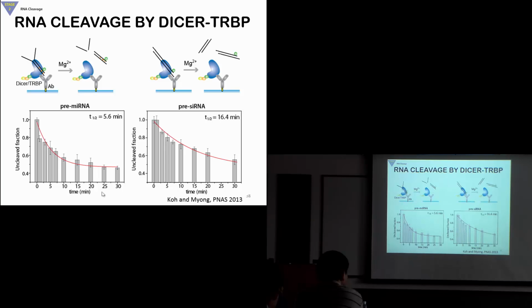PIFE looks like this. So you actually gain sensitivity in this very small distance range, like 1 to about 3, 4 nanometers. This is another benefit of using both assays to get a complete idea about this whole range of distance. So we use it for that reason too. That's a good question. That's already published, so you can look up more.